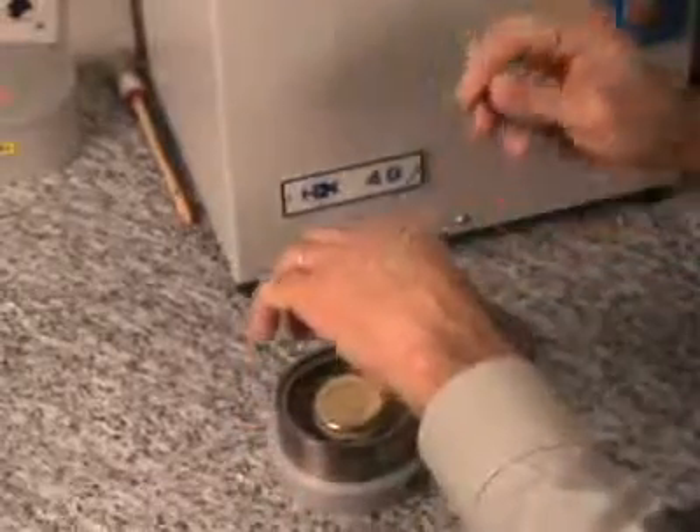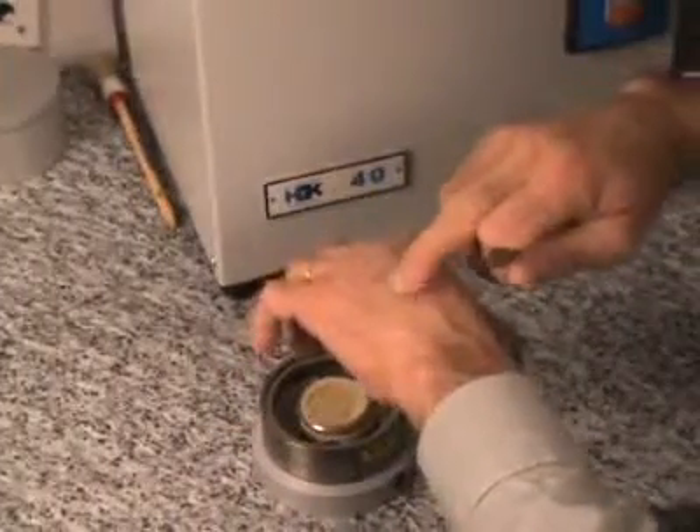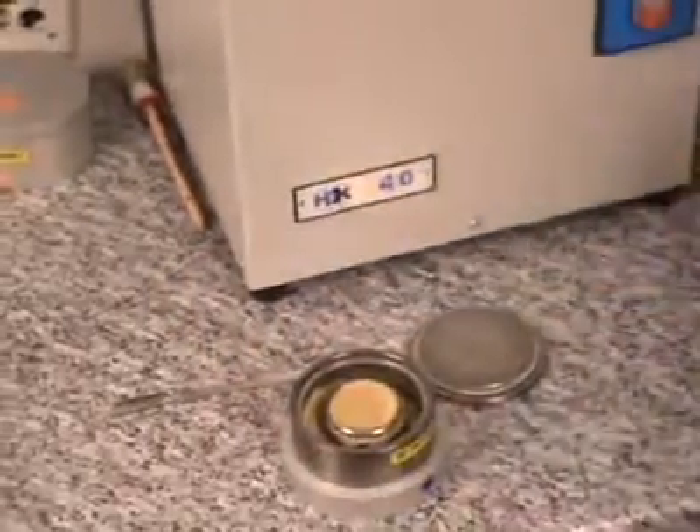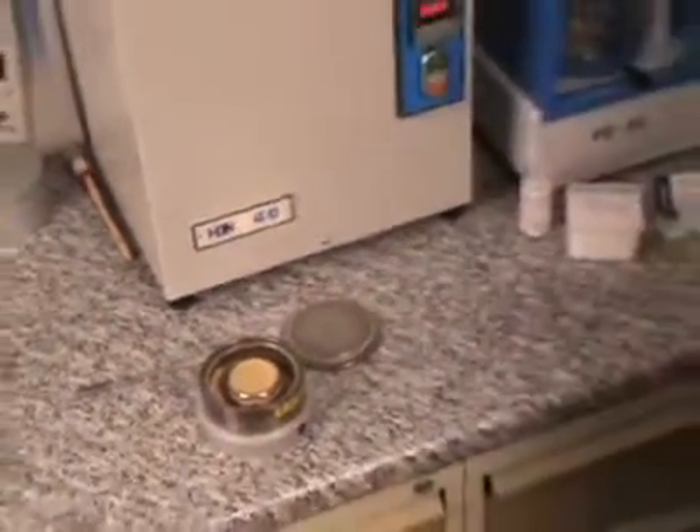Here is a practical test. If you don't feel any grains on your skin, you are below 100 micron.